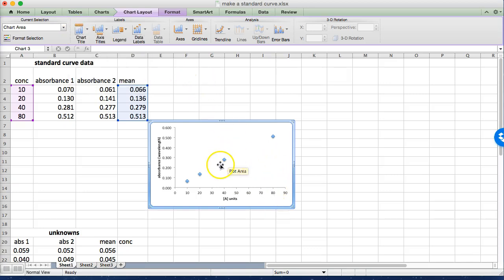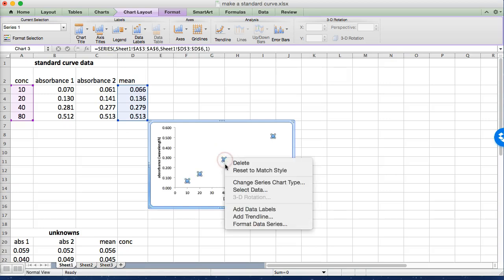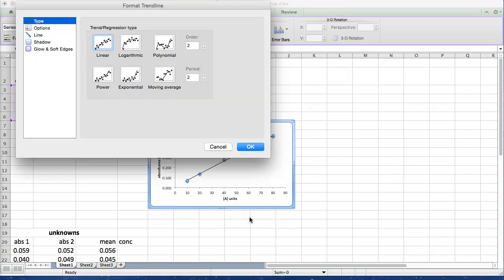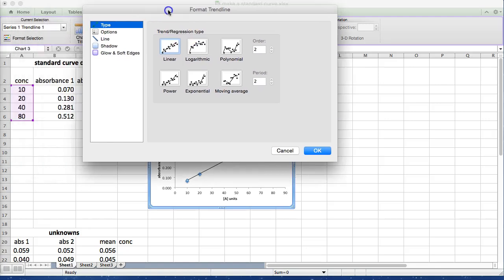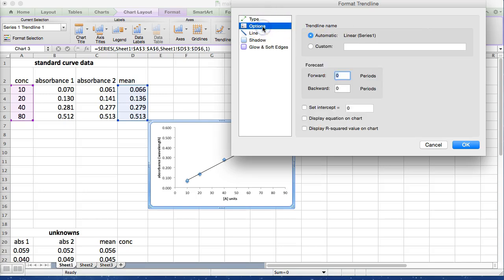So the next thing you want to do is find our best fit line. Click any one of your series points and then right click and select add trendline. And you're going to get a little dialog box that's going to ask you what you want. Generally Excel defaults to linear which in this case is exactly what we're wanting. We can go to options.